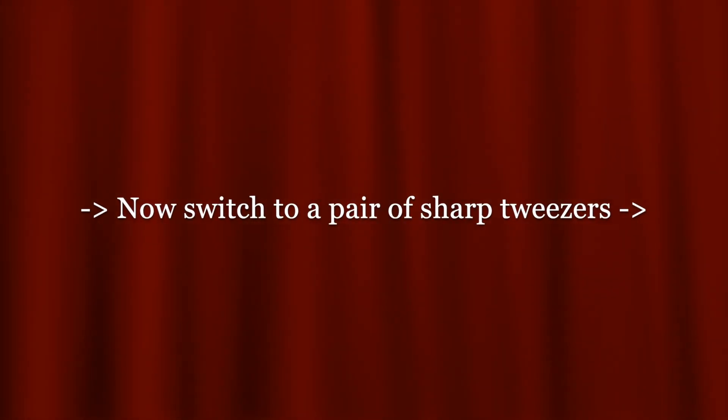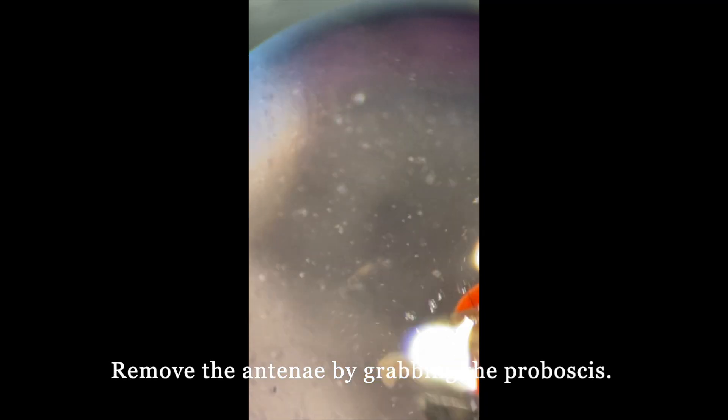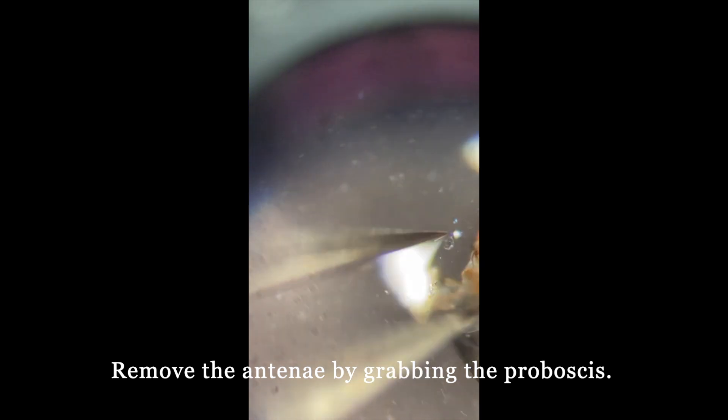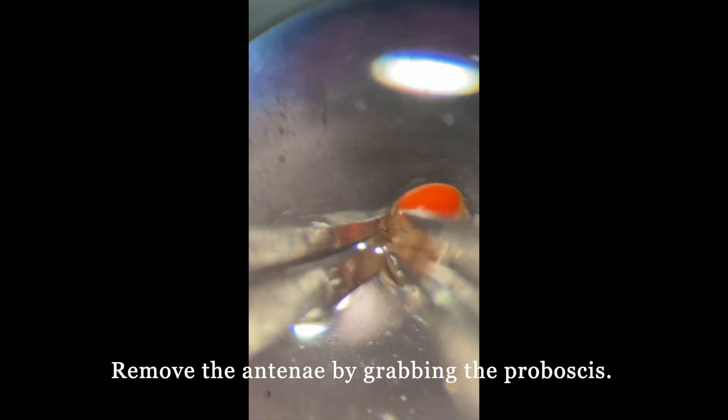Now, switch to a pair of sharp tweezers. We start off the process of dissection by removing the antennae by grabbing the proboscis.